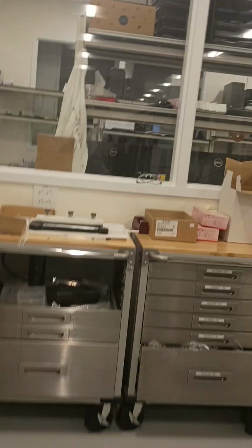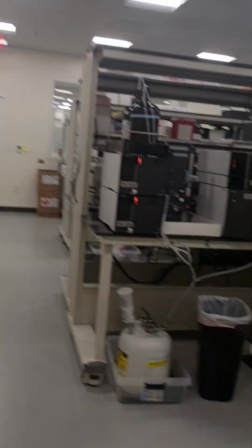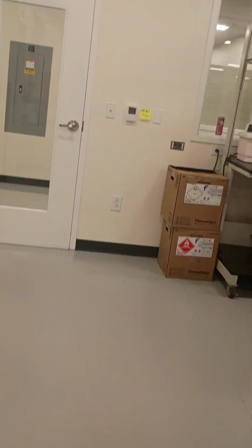So now let's go to the lyophilization room. What happens when we purify here? We have liquids. In order to turn those liquids into powder, which is what the customer wants, we come here.